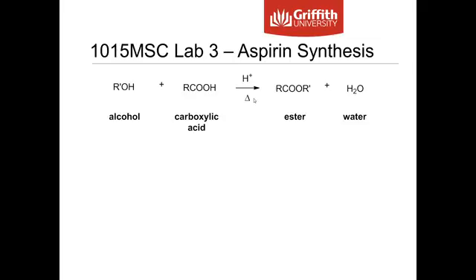When we go to do this in the lab, the water, one of the products there, can actually result in the hydrolysis of the ester. So we get the reverse reaction to get the alcohol and the carboxylic acid. This then decreases the yield of the ester.